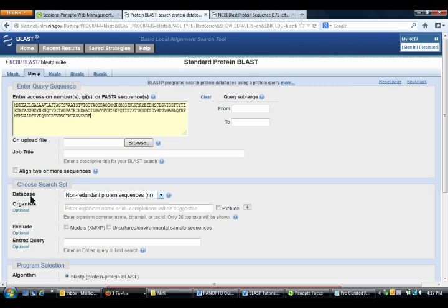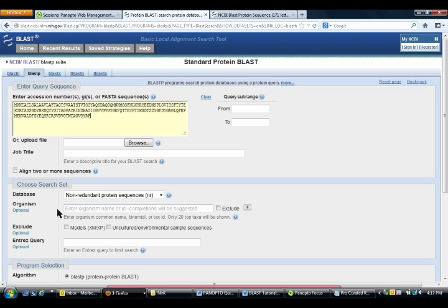Ensure that under database it says non-redundant protein sequences. For now, leave the organism blank. You will need that for part 2 done in class.